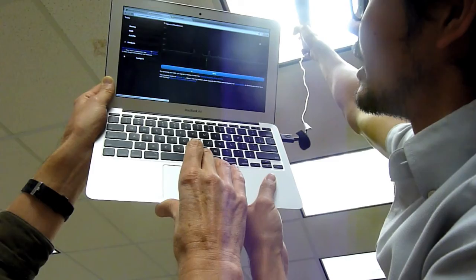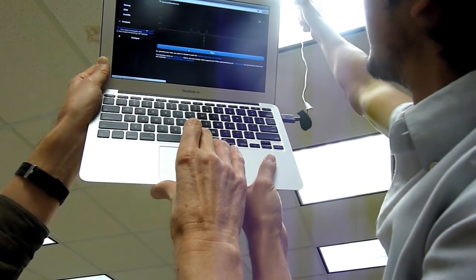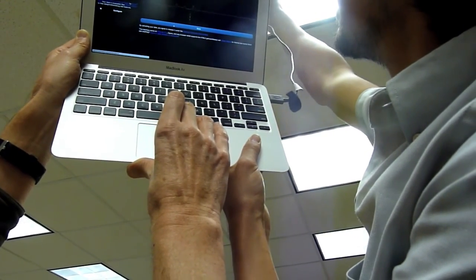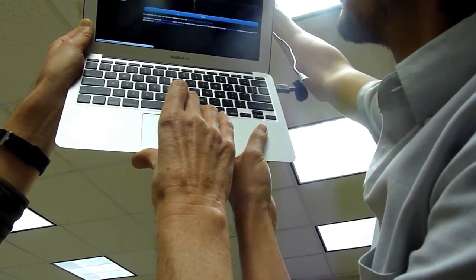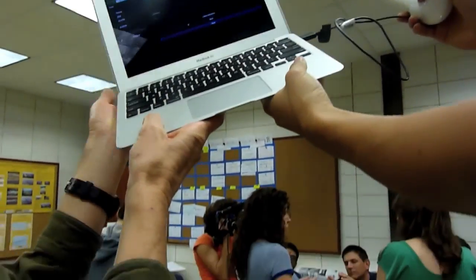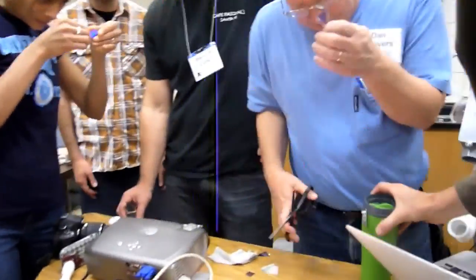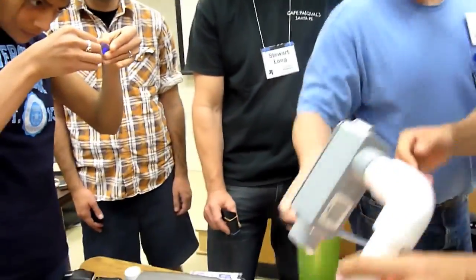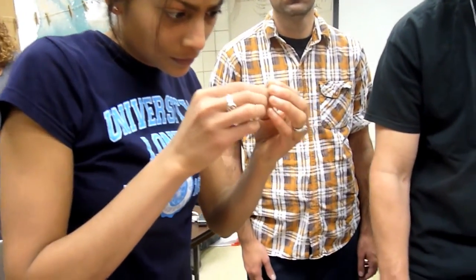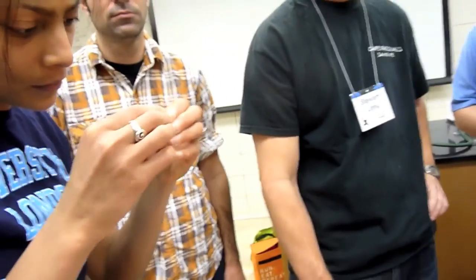We can do it based on this, but it's interesting. You had like 3x the amplitude earlier, and now it's eluding us. That's good enough. Just get that, and then we'll name it calibration. It doesn't even matter, but this will be a little rough. Keep in mind, choose the most basic ones, the focused one. The point of what we use it for is calibration, so name it that.